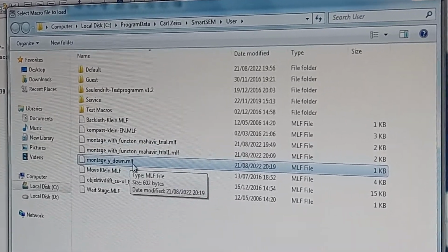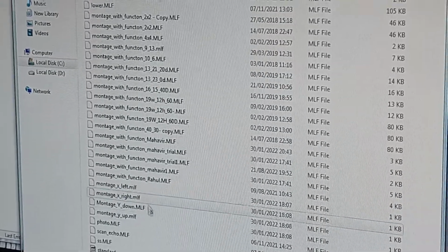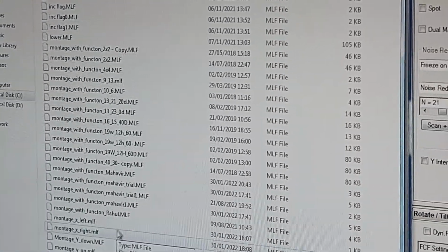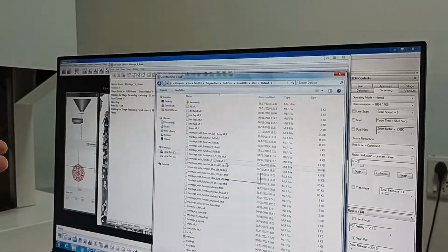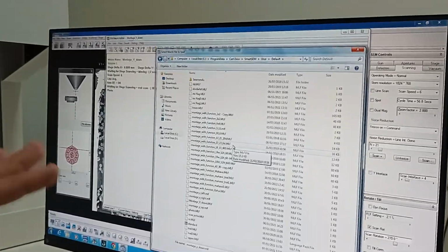Then we have to, if I'm running this macro in another folder, then these macros should be changed. Then we have to save now in another file, because it is not allowing us to select the folder. So we have to manually put it wherever we want to keep it. So I'm not going to worry about those things.